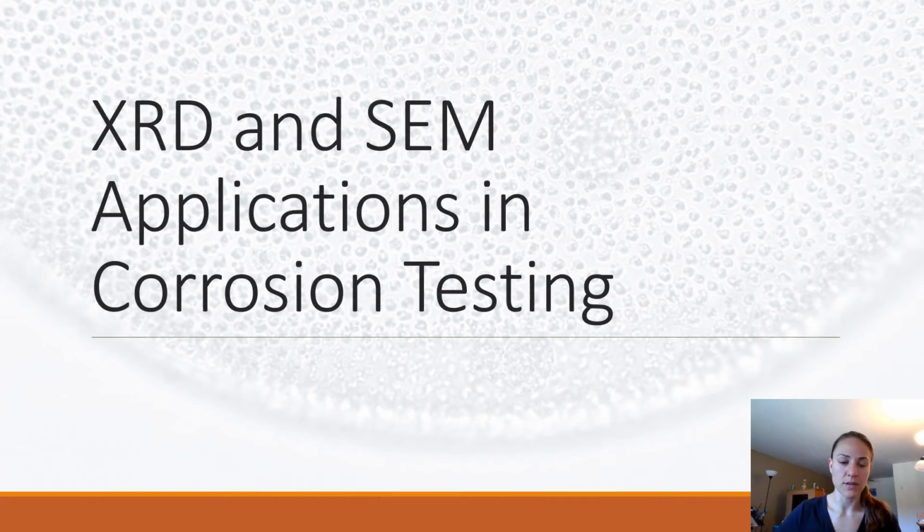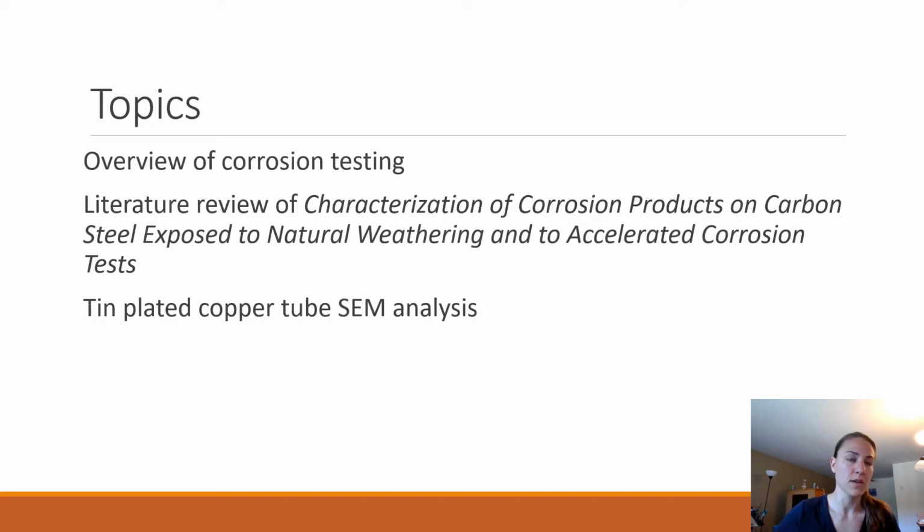So today I'll be talking about XRD and SEM applications in corrosion testing. The topics I want to discuss: first, an overview of corrosion testing, what it is, how it works, what it's for, and then I will be reviewing a study done on the characterization of corrosion products on carbon steel exposed to natural weathering and to accelerated corrosion tests.